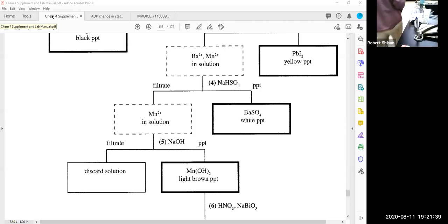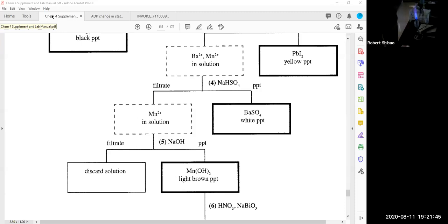I need to turn off the light, make it easier to see. So we have the flame here, and the test tube. Need some test tube clamp. Test tube clamp here.